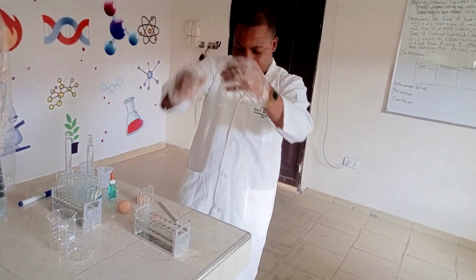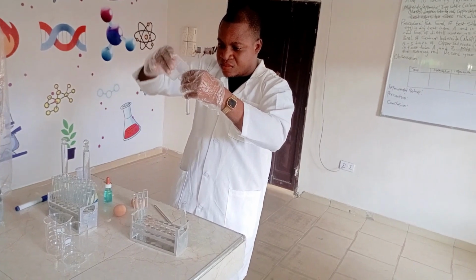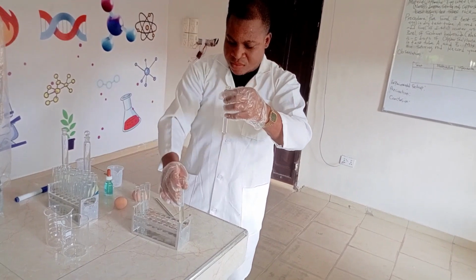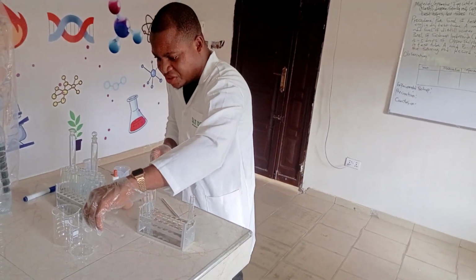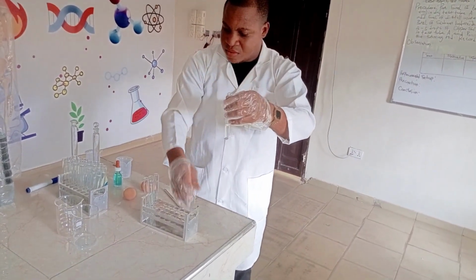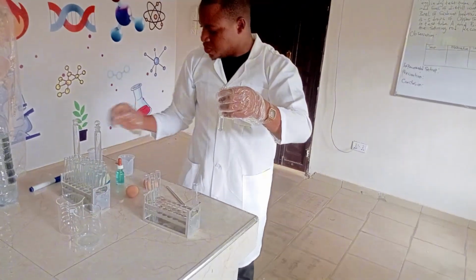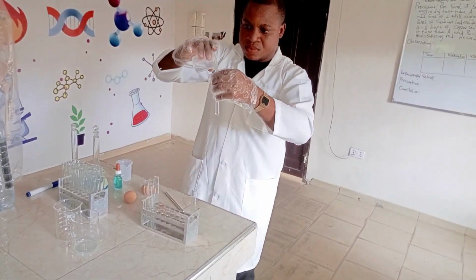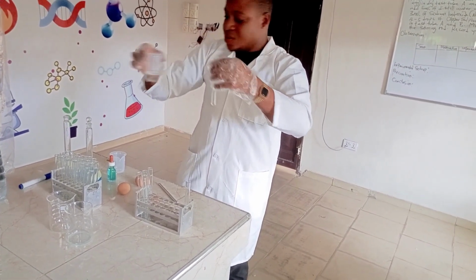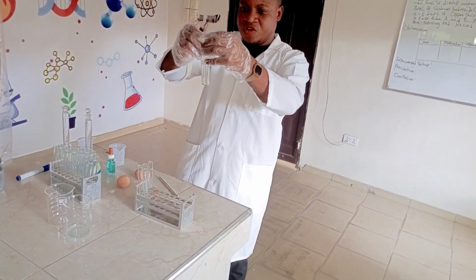Now I've gotten that. Let me bring the volume to be equal. Reduce this. Okay, the volumes are equal.